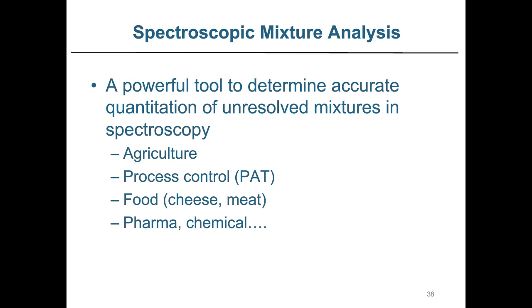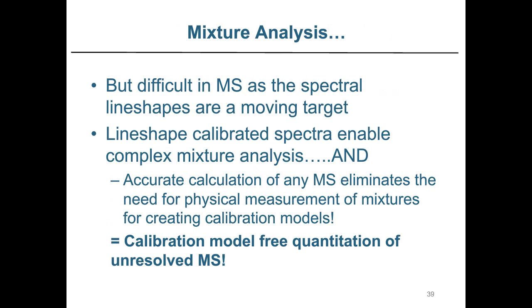Process control in small molecule pharmaceuticals is a very popular application for Raman and near-infrared instruments, for food, for measuring, for example, fat and moisture in cheese and meat, and also applications in pharmaceutical and chemical. So it's a very powerful spectroscopic tool.